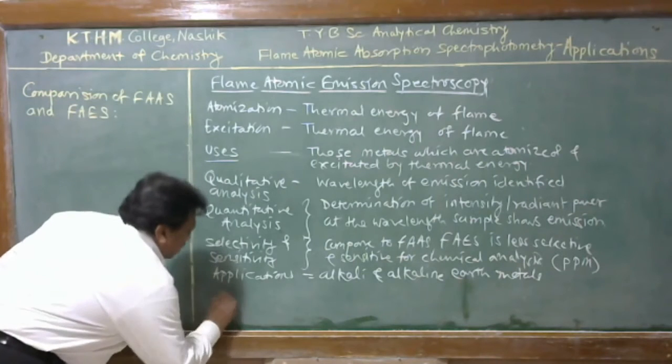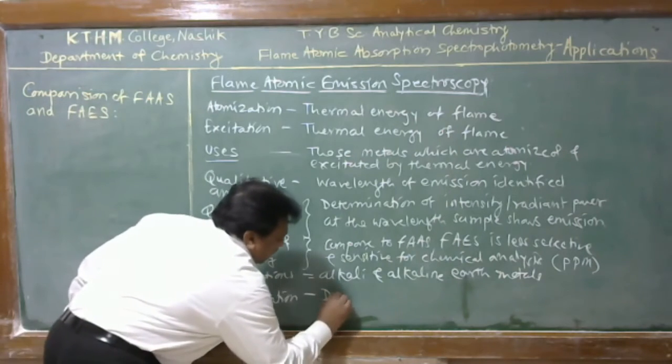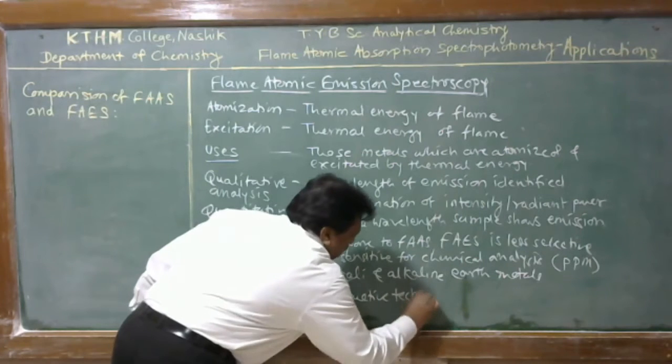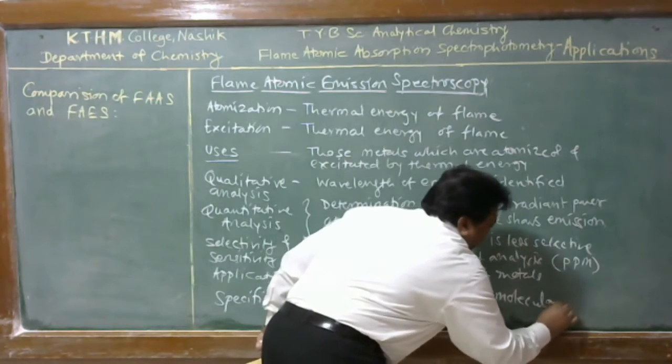Now, another specification is that it is also a destructive technique and gives no molecular information.